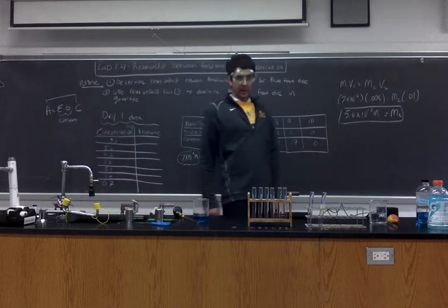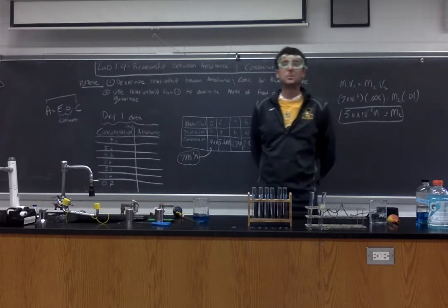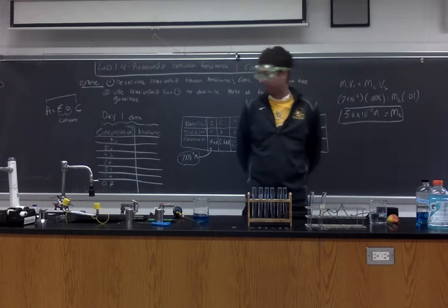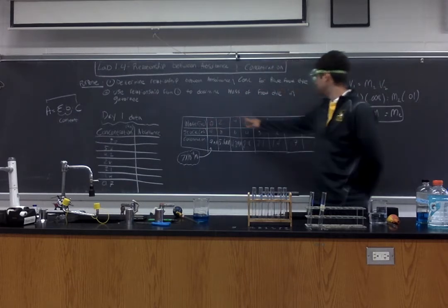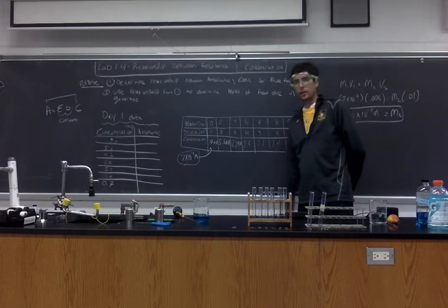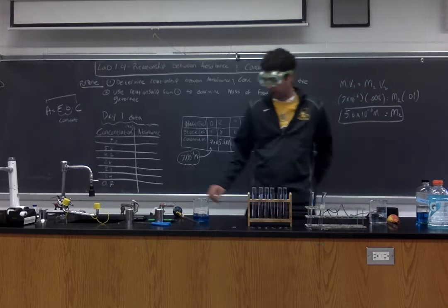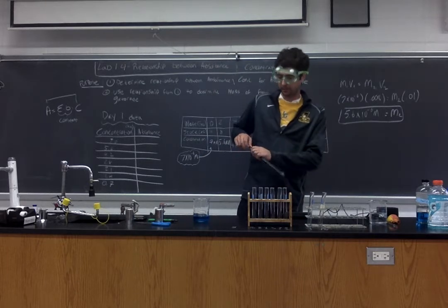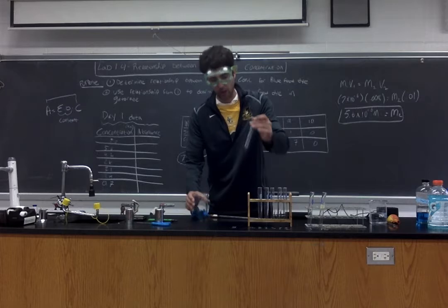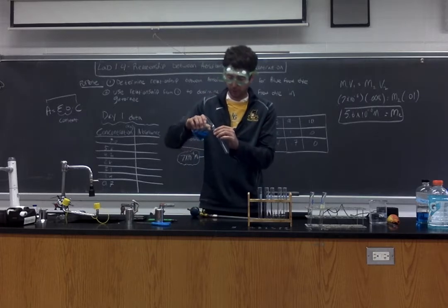This is going to take me about 5 to 10 minutes here, ladies and gentlemen, so if you want to speed up the video or fast forward about 10 minutes, I'm simply going to be making these solutions using my 2 volumetric pipettes. So it's going to take a little bit of time here. Feel free to fast forward or just skip ahead in the video. The first one is all stock, so I actually don't have to measure. I can pour directly in.